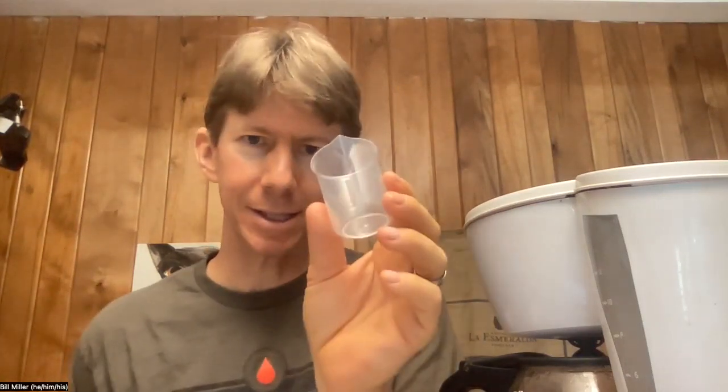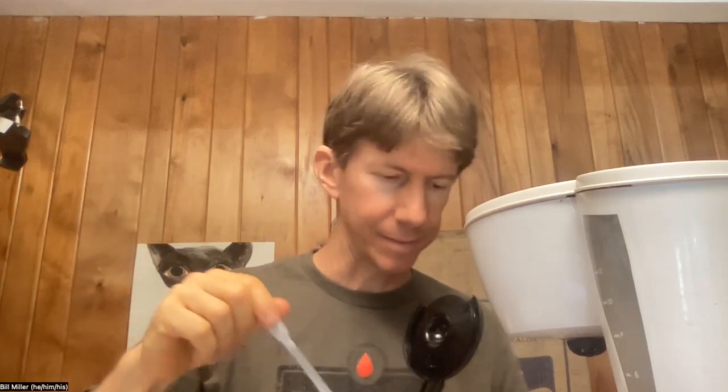It looks like my coffee is just finished making. I'm going to take a sample. Your sample needs to be approximately 15 milliliters in this cup, which for me is about six or seven squirts. Four, five, six, seven. Put that back on there so it can keep heating.